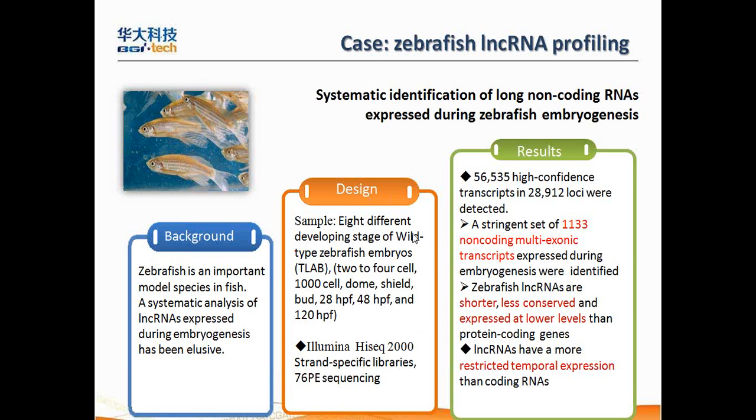They chose 8 different developing stages of wild zebrafish embryos. This is the 8 different stages, and they sequenced the long non-coding RNA in all these 8 samples, and they used the Illumina HiSeq 2000, and they used the strand-specific library.